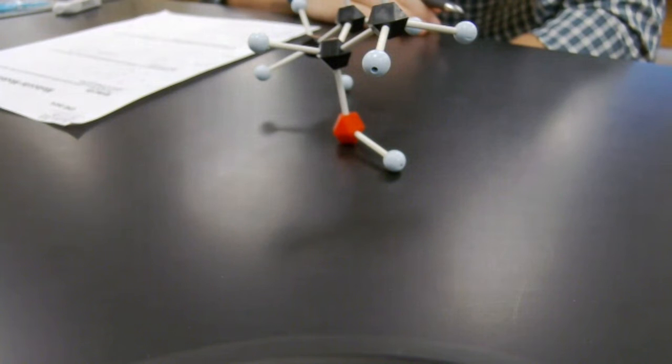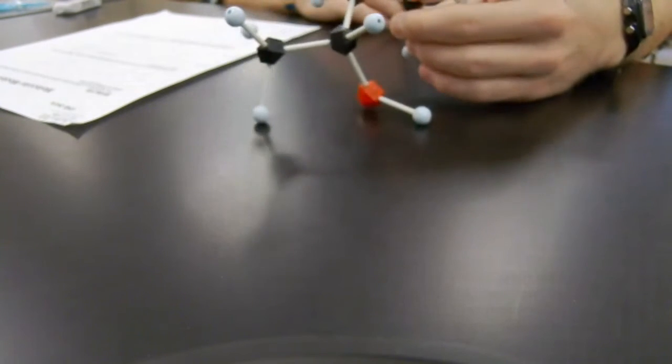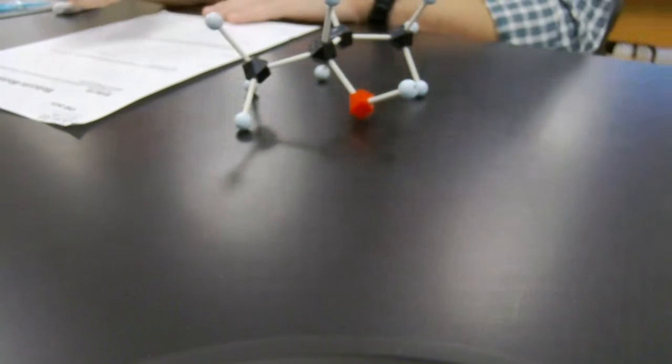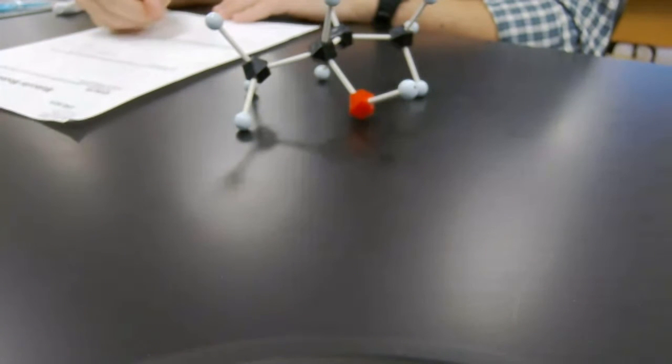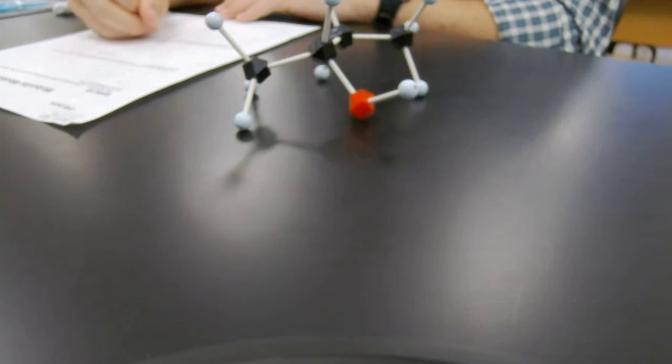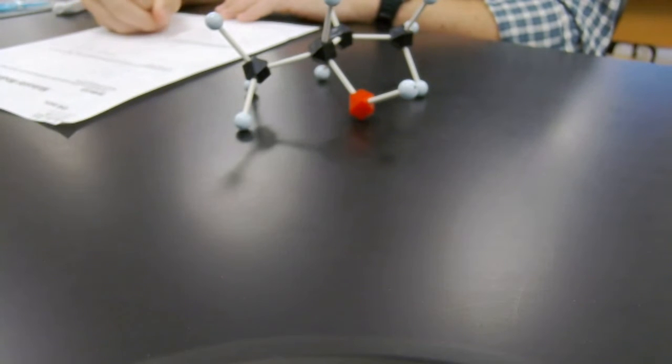This is just a little ball and stick representation of what we think the molecule should look like based on the length of bonds. Bonds to iodine are longer than bonds to bromine, which are longer than bonds to chlorine, which are much longer than bonds to hydrogen. If I click this icon at the very bottom right, which has an energy profile pointing downwards, it will perform an energy minimization and tell me at the end, down here at the bottom, the total energy for this molecule in kilojoules per mole.